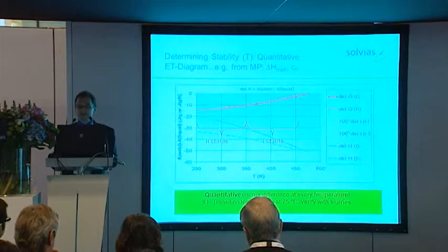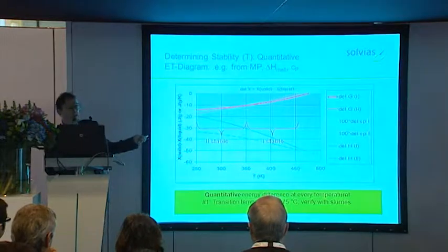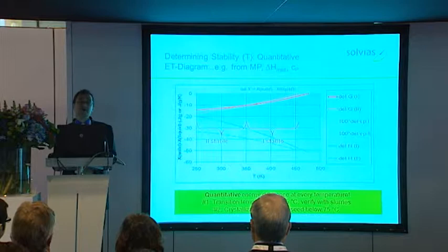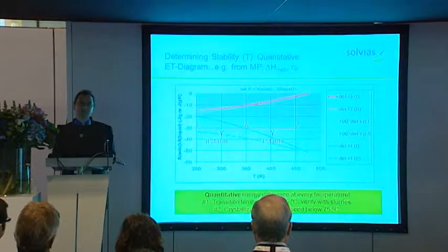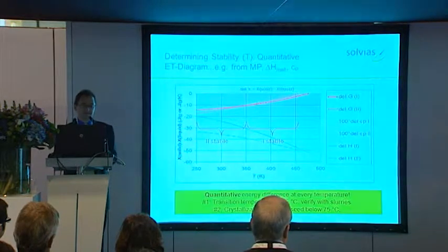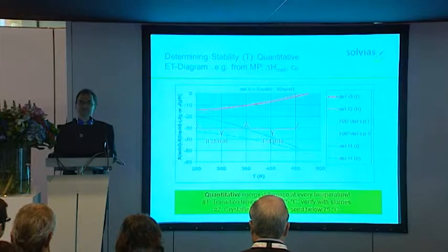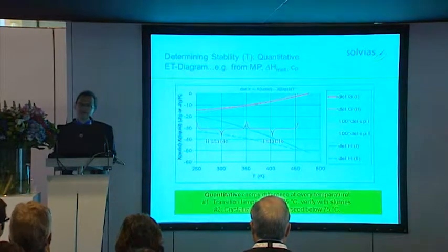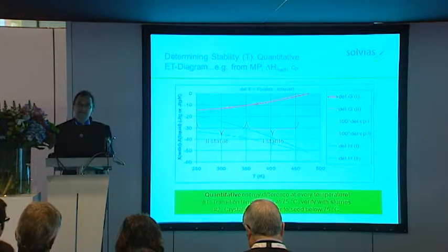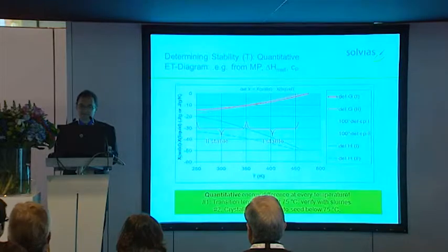Such a transition temperature, which we would calculate here from thermal data, we would then of course also verify with slurry experiments at various temperatures to make sure that 75 degrees is the exact temperature. So from such a characterization you learn a lot about, first of all, which form to choose, and secondly you learn things about how you should carry out your crystallization process later.